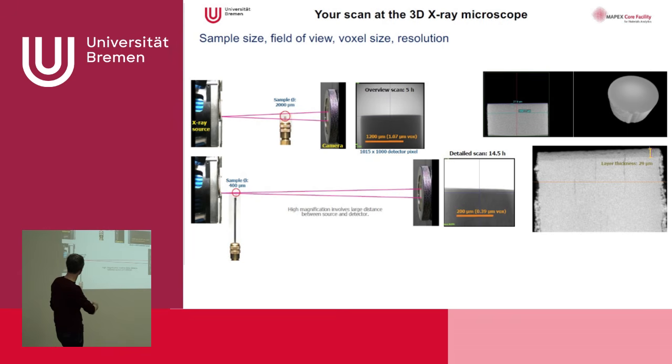But our sample has to be cut. It's not like this. It's about 400 micron thick. So it's really preparation work. If you have this kind of alloy, you have to prepare it, because otherwise this is not imaged. If it would be 2 millimeter, it's out of the image. But if we want to have a good image from this layer, we have to cut our sample.